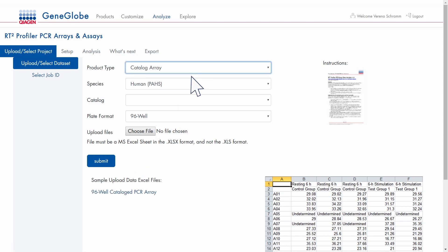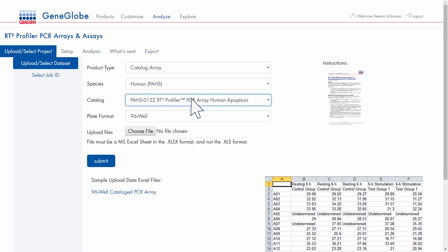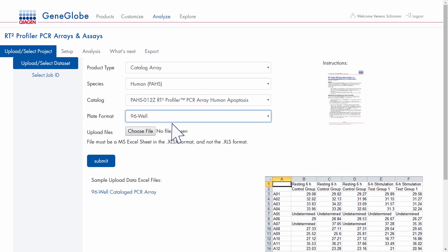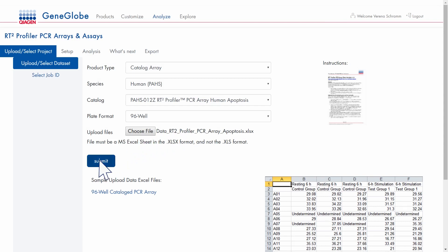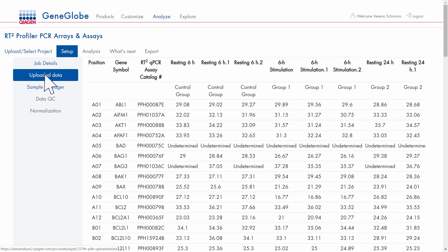Select your product details, upload your data set and submit. Review your job details and uploaded data.